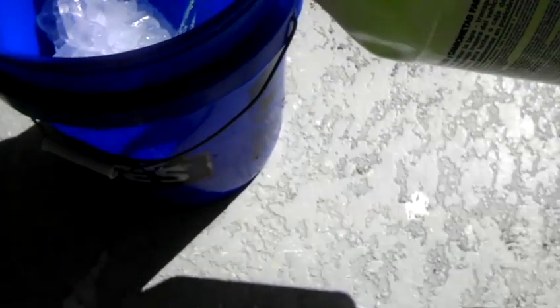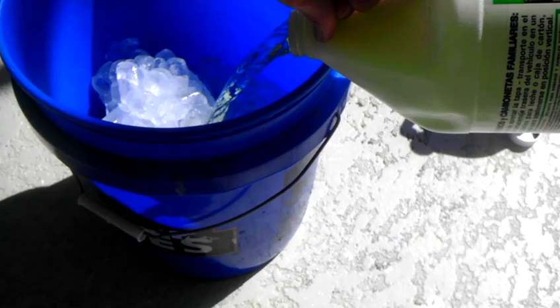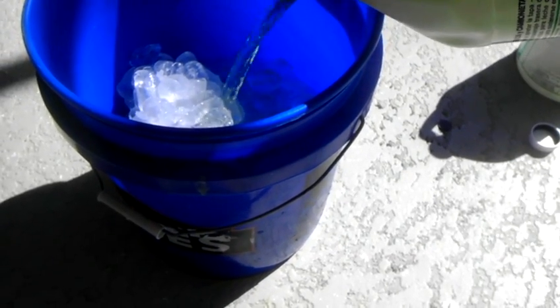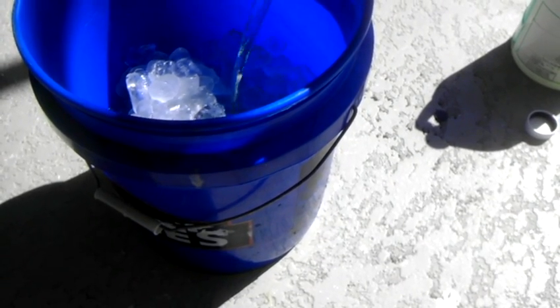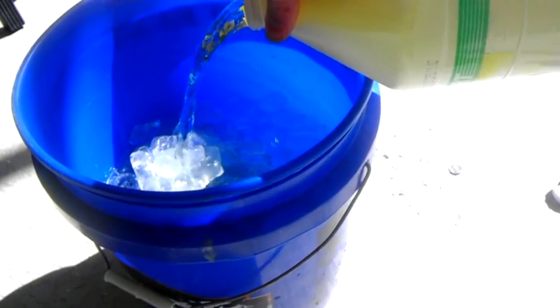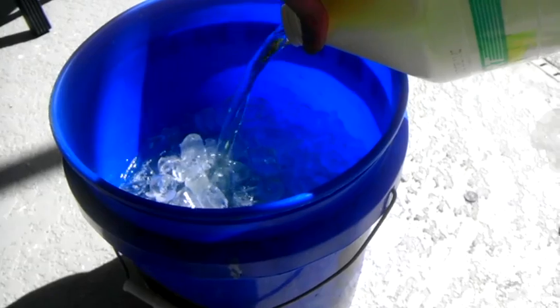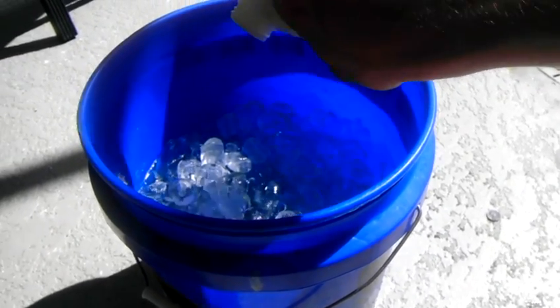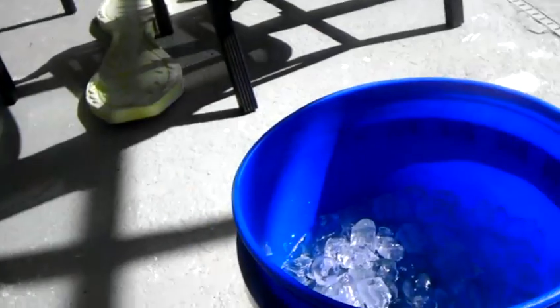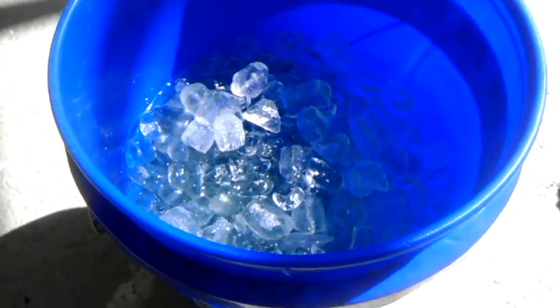Here I go. I'm adding my bleach. Smells fantastic. And don't do this in any clothes you don't want to lose, because you'll probably splash. There's one gallon. That's two gallons — 7,570 milliliters of 10% sodium hypochlorite solution. I'm just going to give this a couple minutes to cool and chill out, and we'll come back and start adding our acetone.